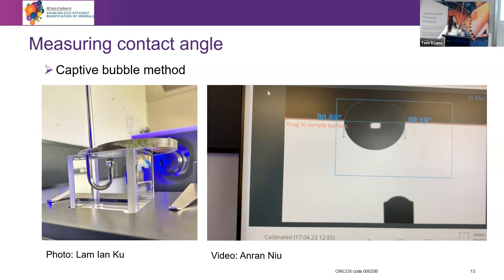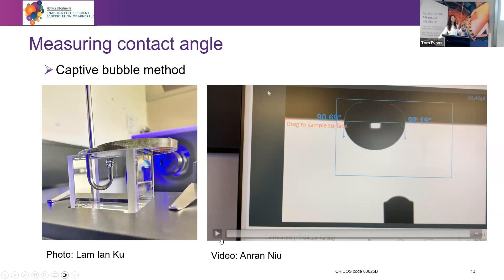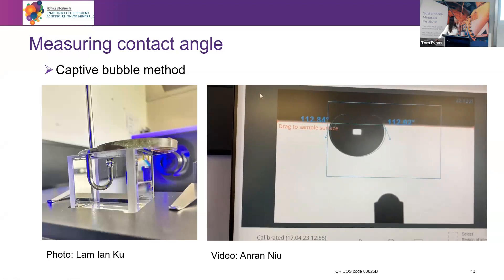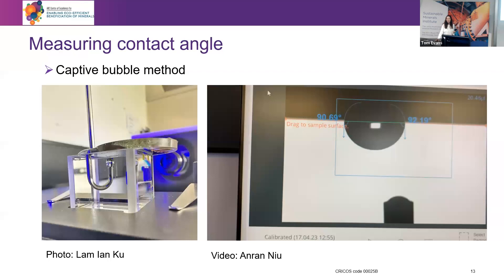This is a video that my PhD student captured that I found very interesting. When you release the bubble, it travels across the surface first and then finds the optimal point to attach — so it's not an immediate process. I think this is very much what may happen in a real flotation cell, especially for coarse particles where the particle surfaces are larger than the air bubbles. These are very interesting studies that enable us to really look deeply into the mechanisms of particle and bubble interactions.